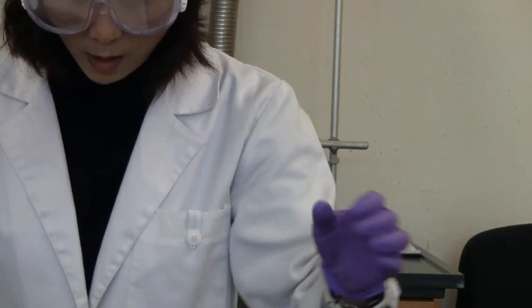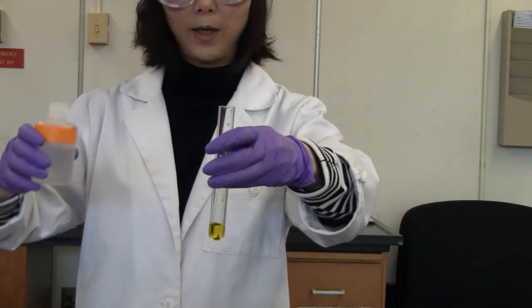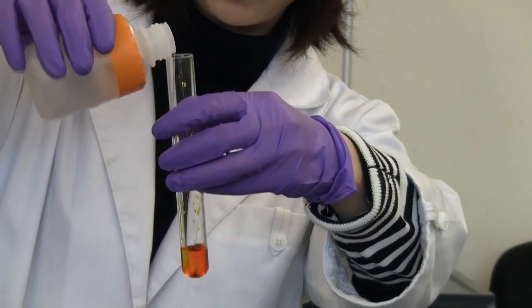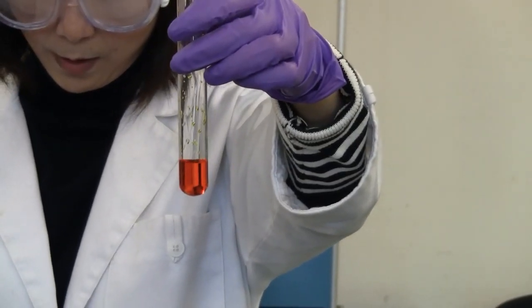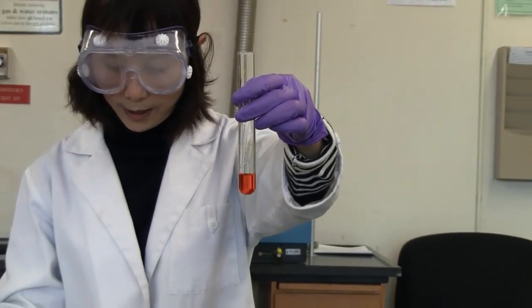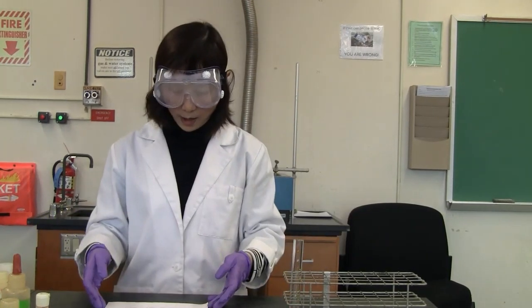Step 2, I'm going to add several drops of the 3 molar sulfuric acid to the test tube. You're going to observe what happened to the color of the solution. So I'm going to add drops, just a little bit. You can see the color change. So write the color on the line next to the equation above. Now step 3, you're going to answer the question there.